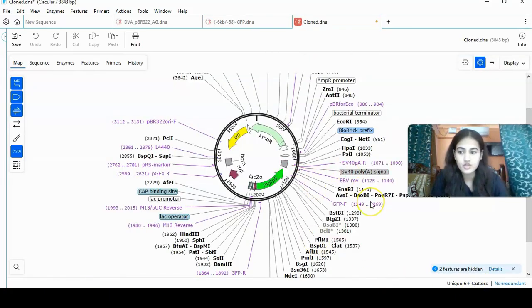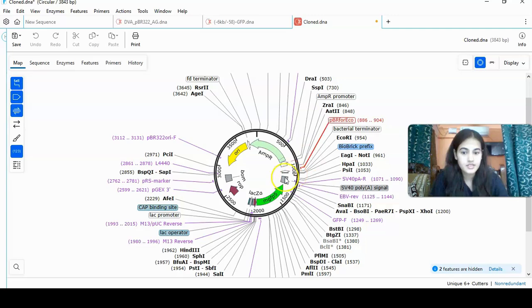So within a fraction of seconds, you got it here. This is your plasmid that has the ORI sequence. This is the ampicillin resistance gene here. And this is your GFP protein here for fluorescence. And this is a part of LacZ-alpha also. It is due to the region we have selected with our selected restriction enzyme and the other genes.